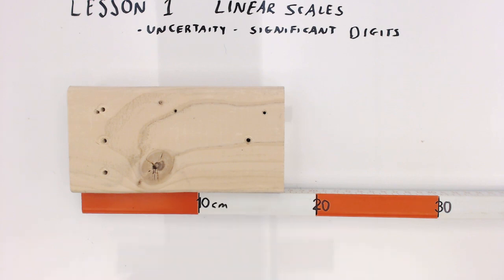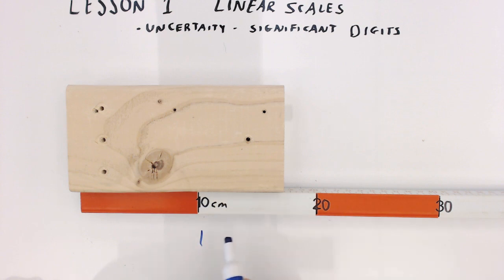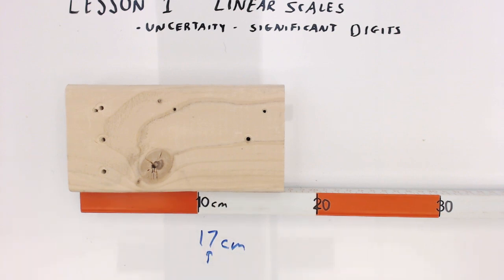So it looks like to me, if I was to guess, let's see, that's about 15, so maybe that's 17, or maybe it's 16, and you'll have to guess. So that last decimal place, I'm sure about the 10 of it, so I know that it's 10 and some more. I'm going to go ahead and guess 10 and 7, and those are centimeters. And I'm going to say that the place that I guessed, the 7, which is in the ones place, you might have said it was a 6.